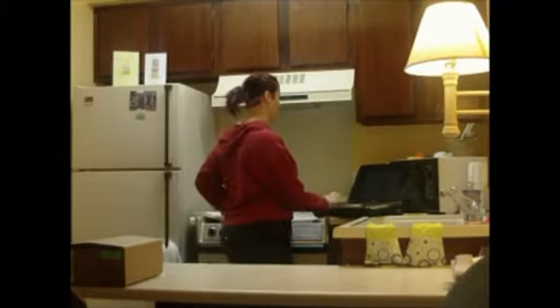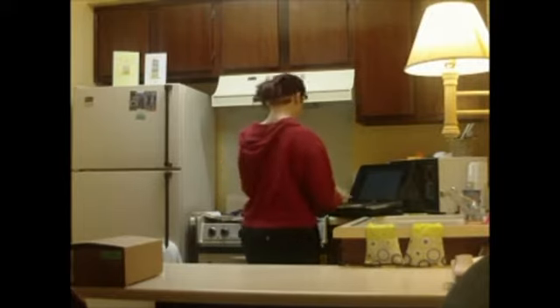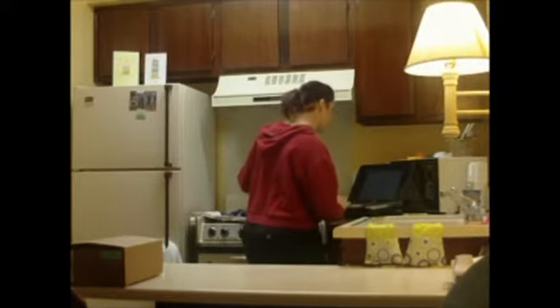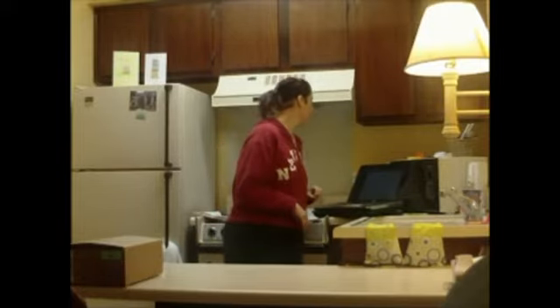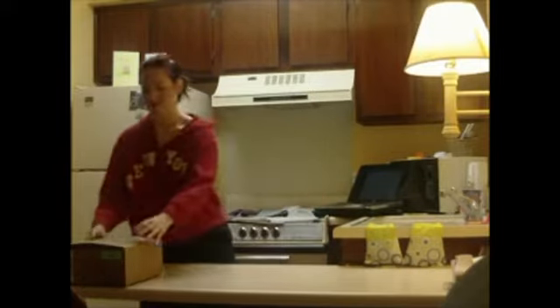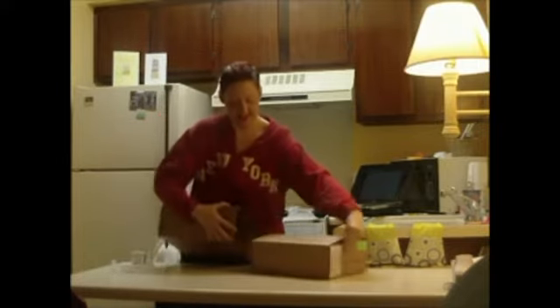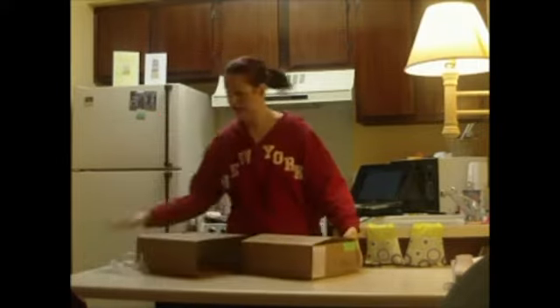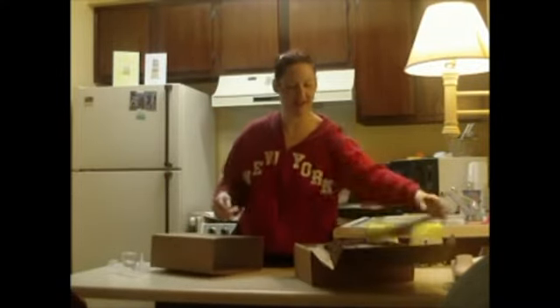And today we are going to be doing a lab on physical and chemical changes. So let me just go ahead and start getting together the proper materials. Looks like first we need to open up our lab pad here with some things drawn before that set aside from a previous lab.